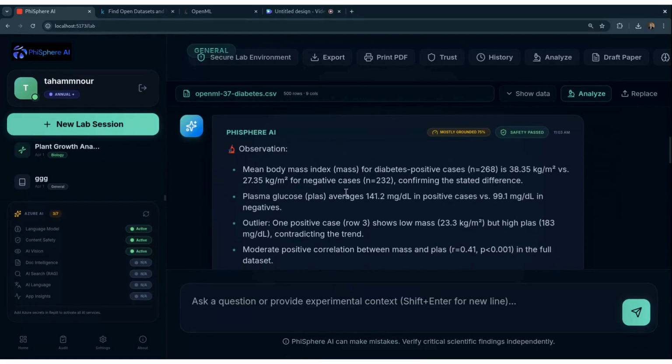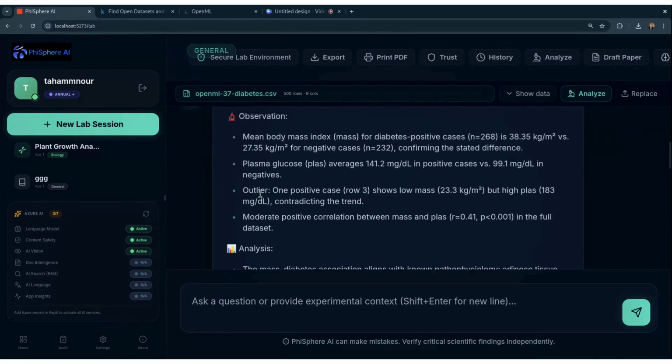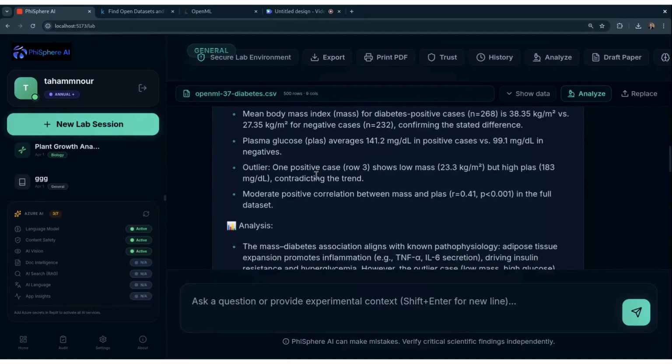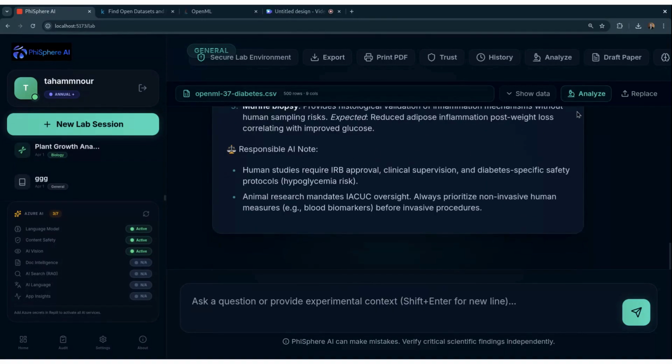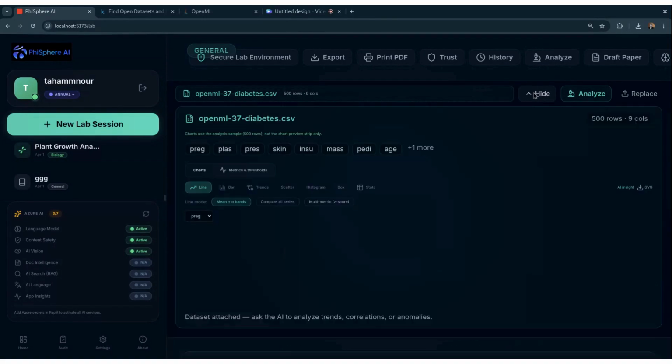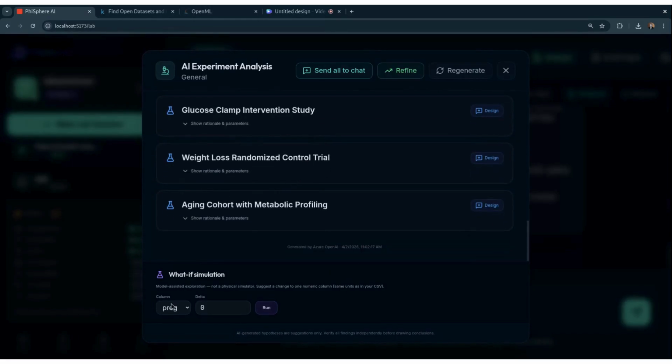That means you can compare decisions, understand how the analysis evolved, and keep a traceable timeline of your reasoning. When you show history on camera, you can talk about how it reduces repeat work. Instead of re-asking the same questions from scratch, you can reference past outputs. You can also use history to check whether a later suggestion is consistent with earlier results, or whether it changed because you uploaded new data.